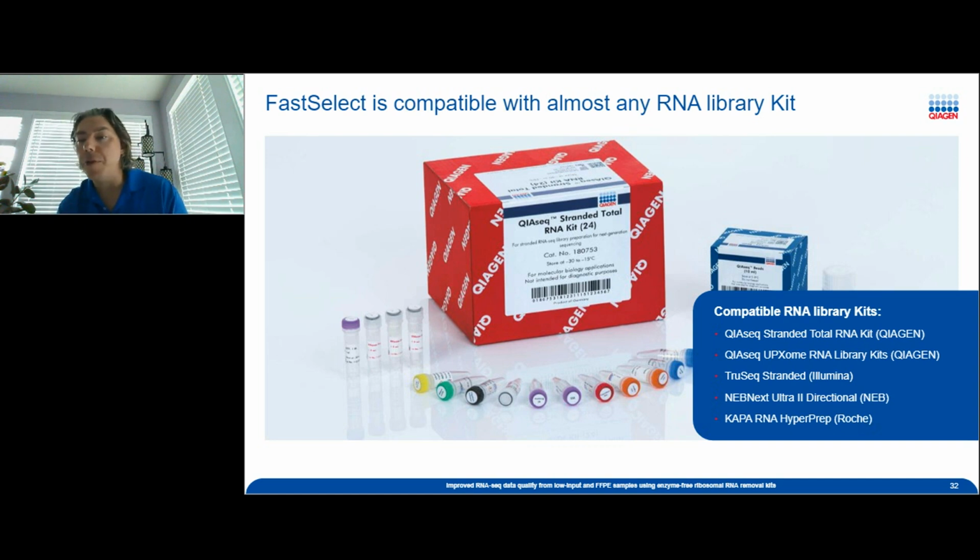We have some researchers that are trying to use it on direct RNA sequencing on an Oxford Nanopore. I would say that it hasn't been 100% successful, but we can see removal of ribosomal RNA. And what we think is it basically becomes too big of a molecule to fit through the pores to be sequenced.